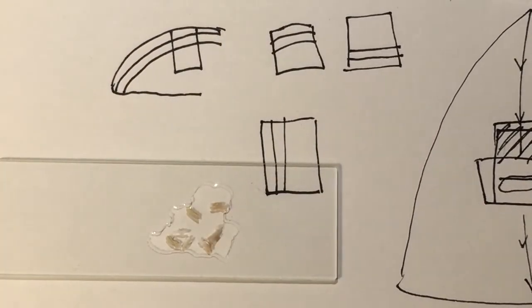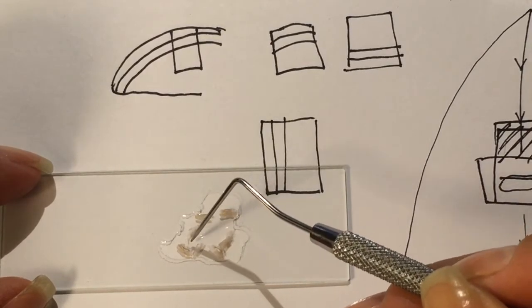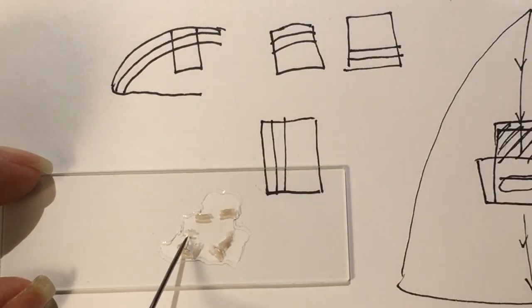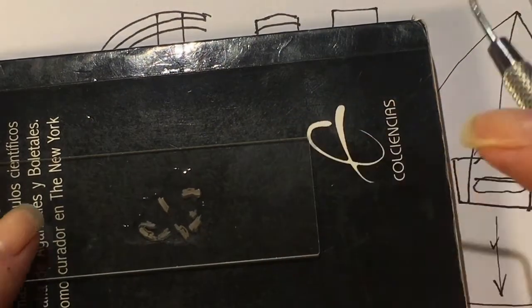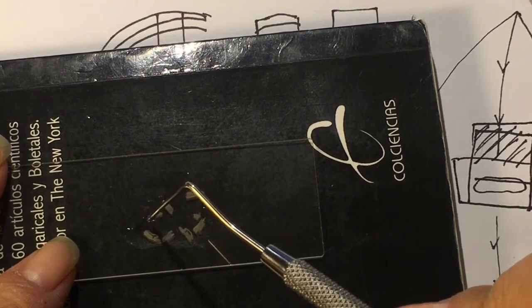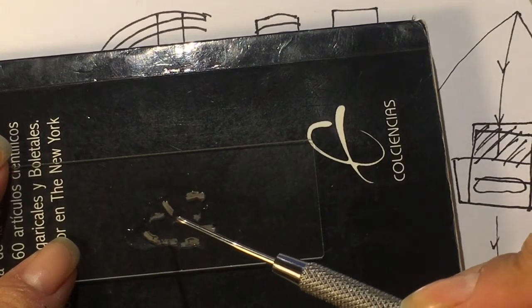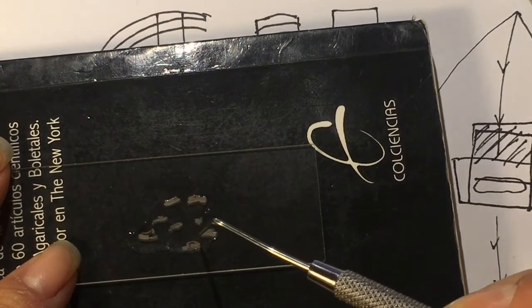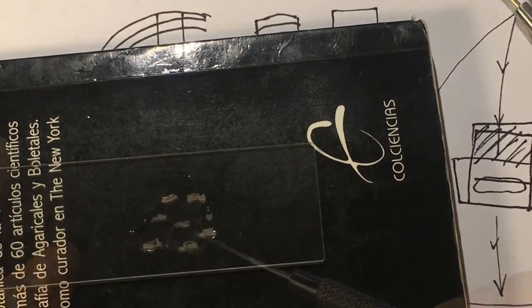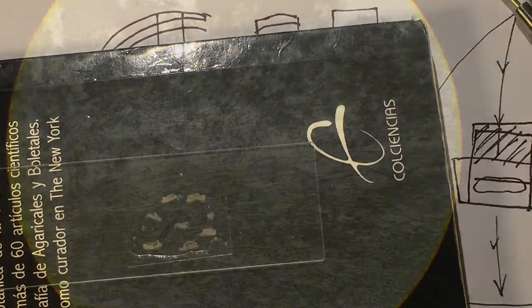So what we have here are several slices. They look very, very thick. The only one that I actually like is this one here. Let me put it on black so the shadow doesn't make it look double. So yeah, this is the only one that I actually like, because it's very, very thin. All these other ones are big slices of cake. Now I'm orienting them the same way, hopefully. This one looks thin. So this was the section that I obtained.